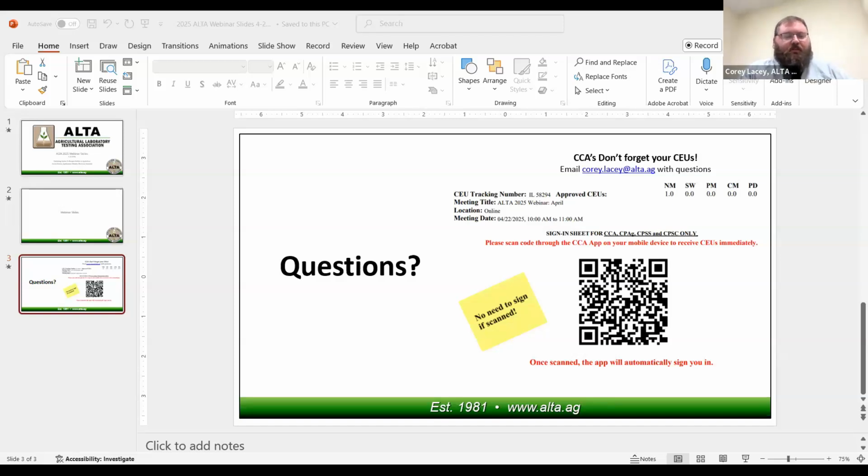We saw some examples where you're using micro balances. Probably no one's doing a micro balance on carbon, but maybe more into like half gram to whole gram sample size. So I would just love if Jessica, if you wanted to kind of kick that off with some deeper thoughts on that sample prep challenge, some real clear like what does Elementar recommend people grind to and sample size when doing soil carbon analysis on soil, and then Bob, maybe you could follow up on that if that works for both of you.